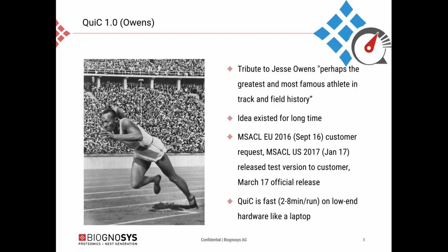As you're attending this webinar, you all know that we have released such a tool. It's called QuiC, for a fast and easy to use QC analysis tool. And as with all of our software releases, we gave QuiC a software name. And in tribute to Jesse Owens, we have named QuiC 1.0 as Owens. It reflects the name of Jesse Owens in a lot of ways.